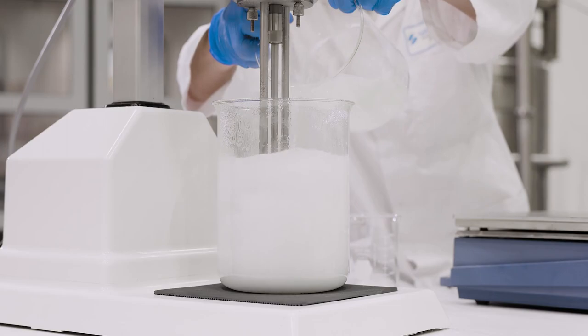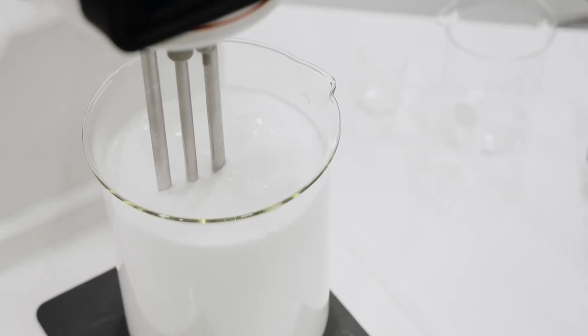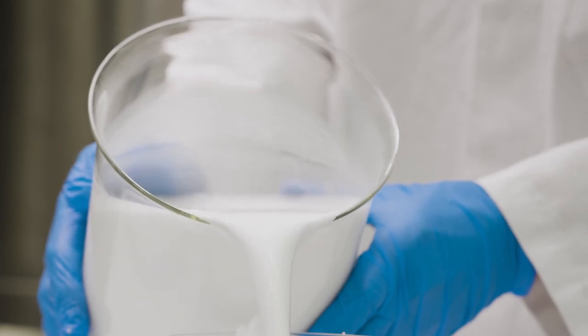The wax is slowly incorporated into the aqueous phase and the Silverson mixer emulsifies them together. The high shear mixing action ensures the wax globules are finely dispersed into the water to give a stable finished product.